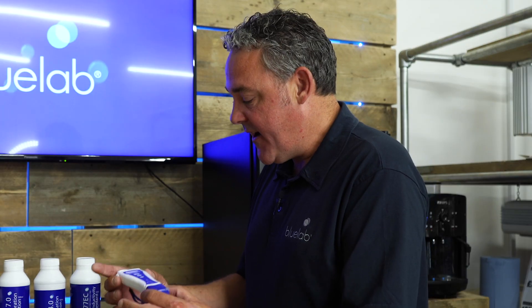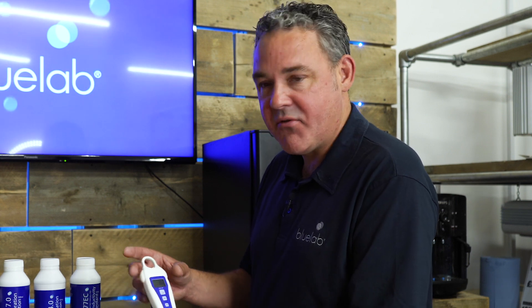The most important thing with your pH pen is to clean it, calibrate it, and make sure it's properly hydrated.